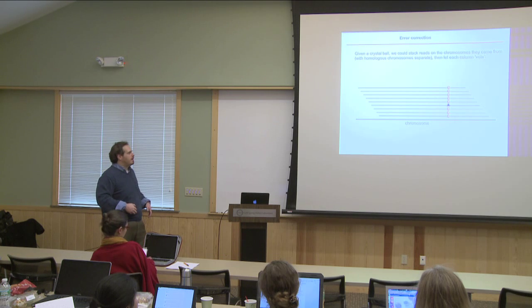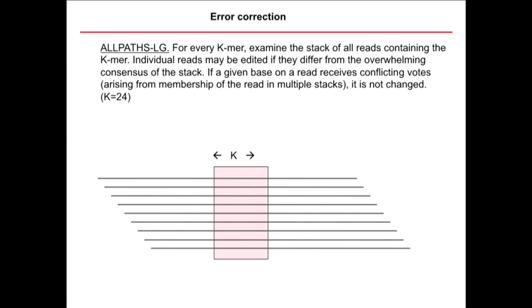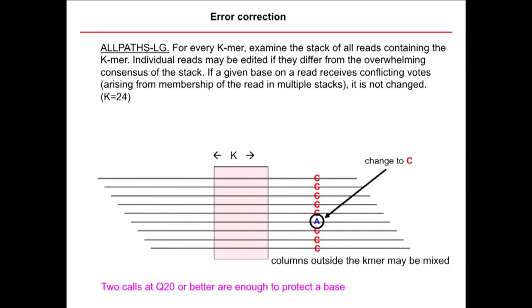That's what we're trying to build up. So the clever approach that they use to do error correction is a word analysis of the unassembled reads. These are called k-mers, to find reads that share some short k-mer. Like, every read here has G-A-T-T-A-C-A. Every read has Gattaca. And if the k-mer is sufficiently long, you have pretty good confidence that all those reads come from the same spot in the genome. Then they look a few base pairs away from that to say, aha, inside this k-mer they're all exactly the same, but here's an error flanking it just a few bases away. It's going to do the error correction, fix that up for you.